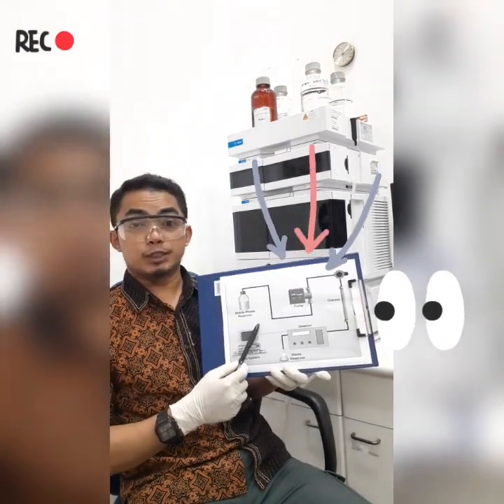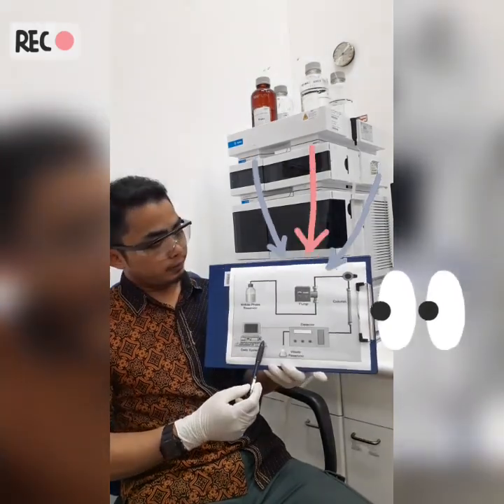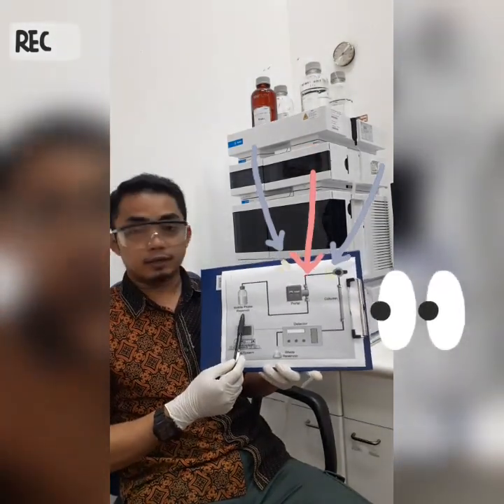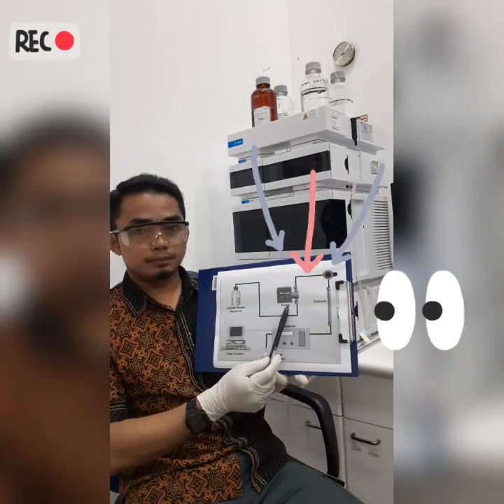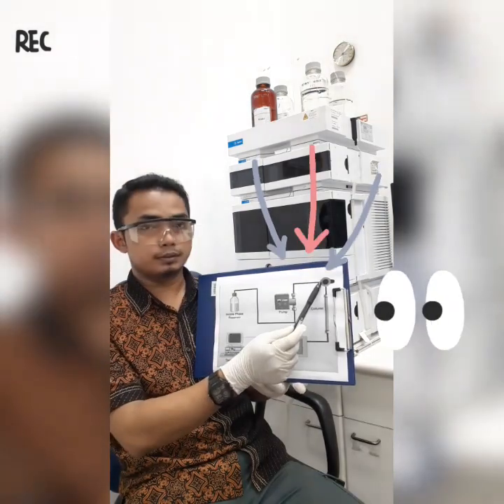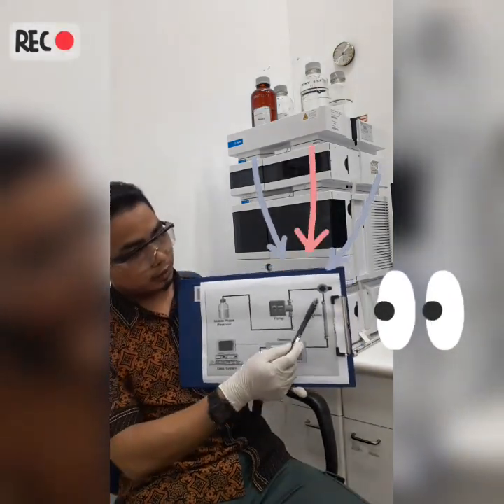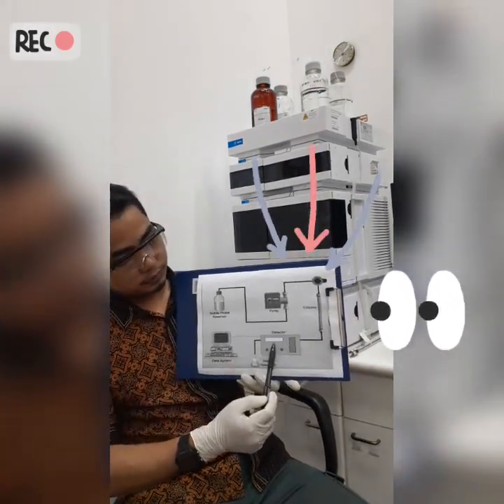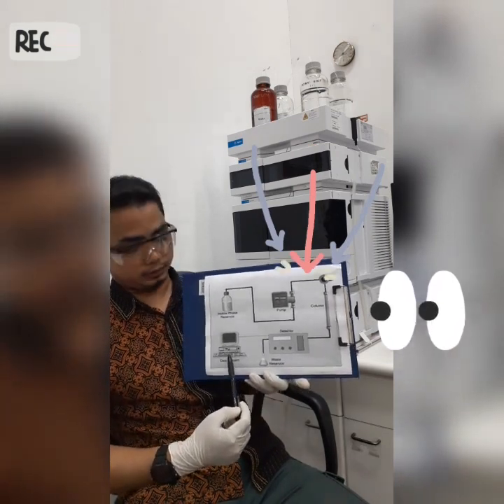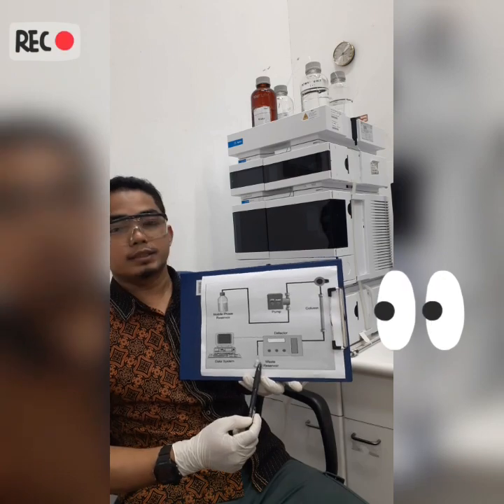Number 1, the mobile phase reservoir, pump, injection system or injector, and then column, detector, and data processing unit, data system, and waste reservoir.